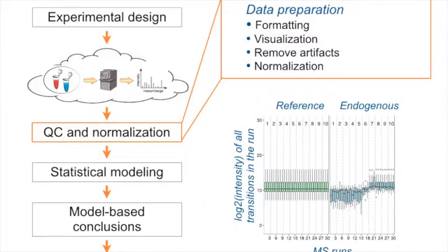The danger with CV is that I can have one method and I have a CV, I have another method, I have a CV, but it's not immediately clear what the assumptions are. And if you do not state your assumptions clearly, you cannot evaluate if those assumptions are plausible. This is something which is underappreciated with normalization, that there's essentially a statistical model behind it. It is really important to spell out exactly the assumption, because the next thing you do is to say, is this assumption plausible for my particular experiment or not? You can put CV as part of this, but it's really important to understand what the assumption behind it was. Okay, let's go back.